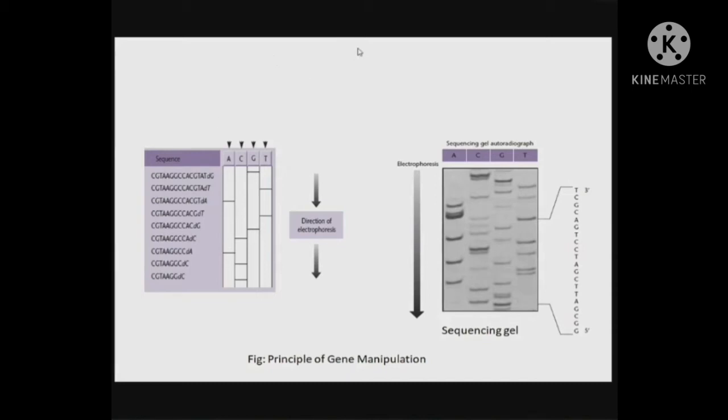So this is not actual, yes. Simant Kumar. So this is 5 to 3 in PCR, but actually we have to complement it. This is primer sequence ka ye sequencing. So this is not the actual sequence. We have to complement it.